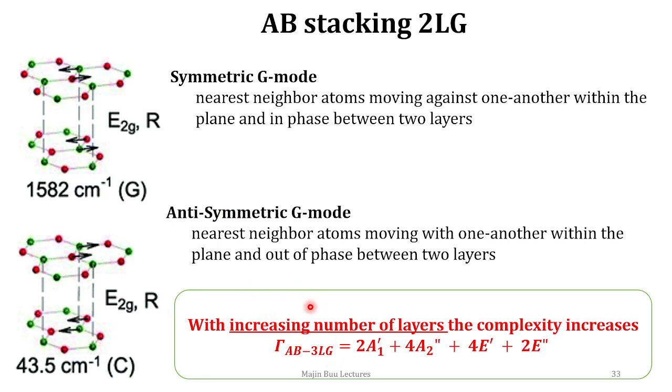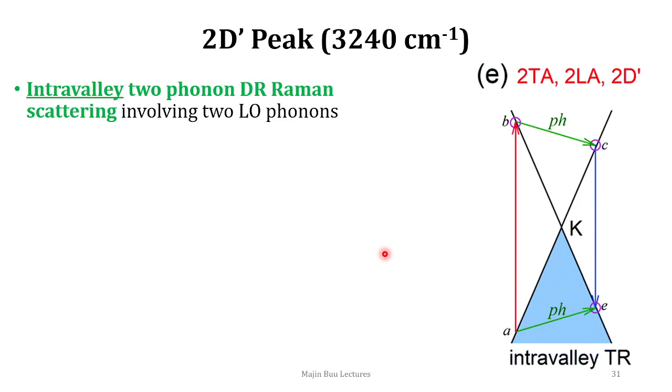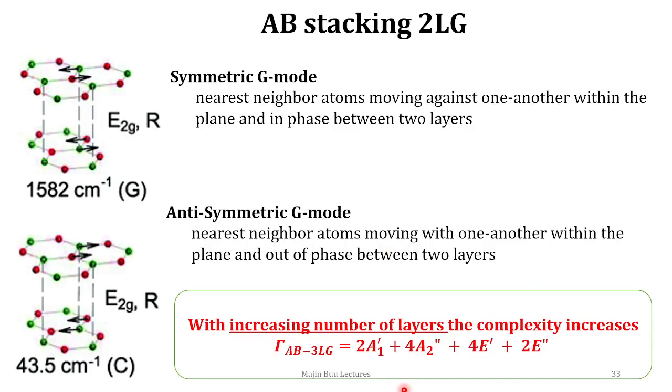Now, as mentioned, with increasing number of layers, the complexity is going to further increase, and the phonon dispersion characteristics are not going to be the simple equation as we had seen in the initial slides, but a combination of acoustic and optical phonons as the number of layers increases. So that is something that needs to be noted.